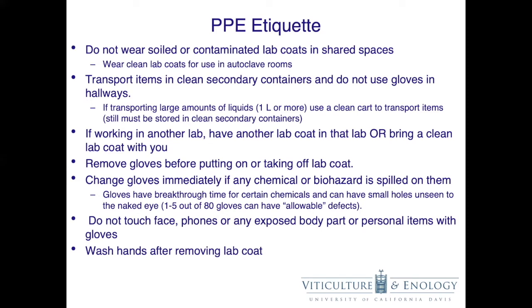If you're working in another lab, have another lab coat in that lab or bring a clean lab coat with you. This is especially important for those working with biohazardous materials. Different labs may have different hazards, and you don't want to contaminate any lab with hazards that you're working with from a different lab. Remove gloves before putting on or taking off your lab coats.